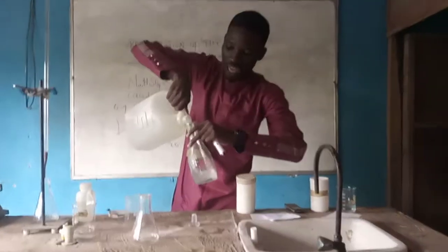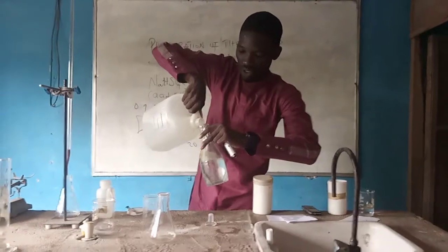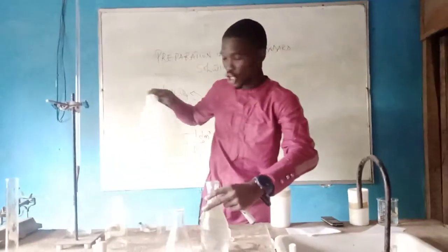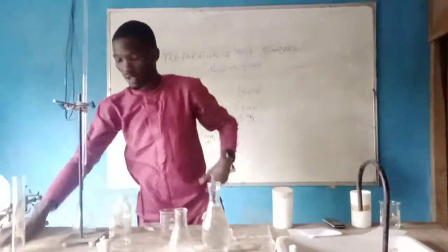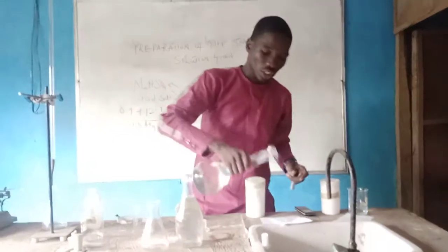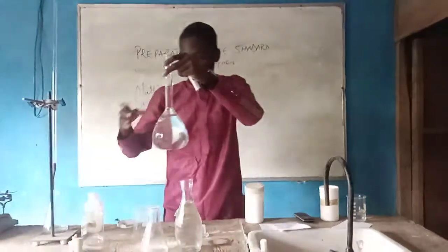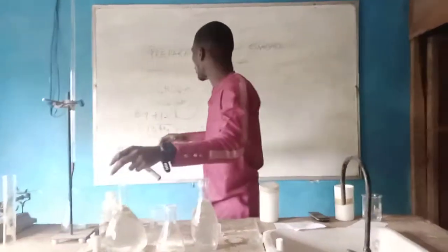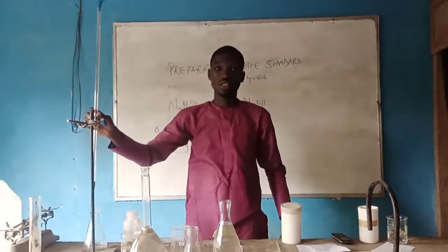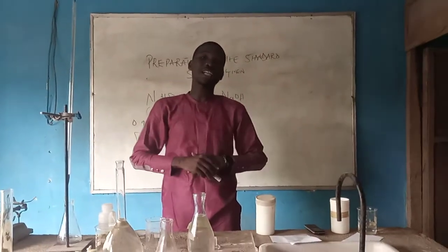So I'll decide to drop this here now. So we have this. So this is our what? Sodium hydroxide. And don't forget that we have to prepare the solution. The acid salt we add as what? The acid, that is going to be what? Run into the burette.